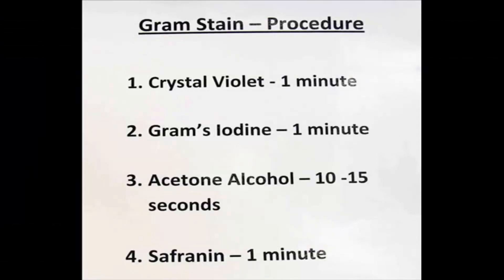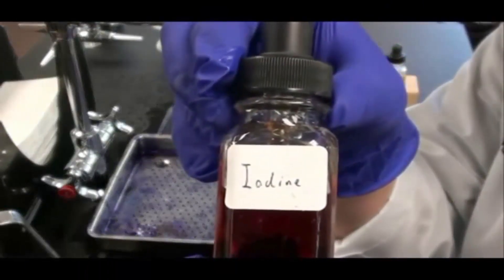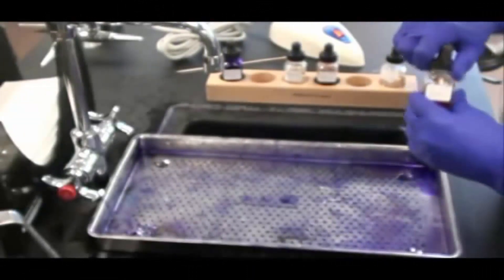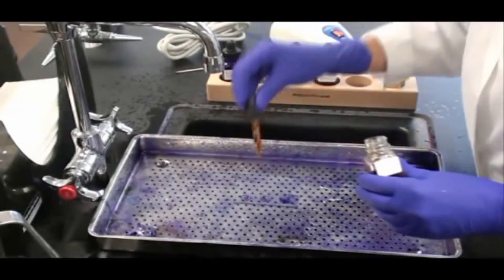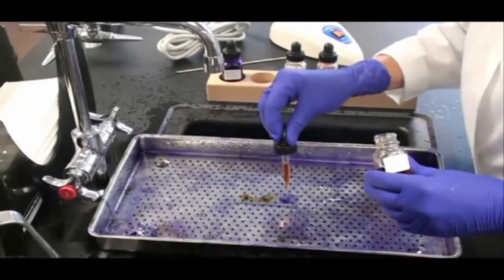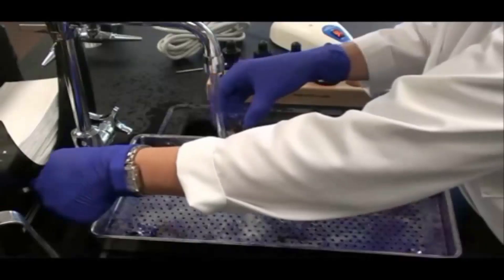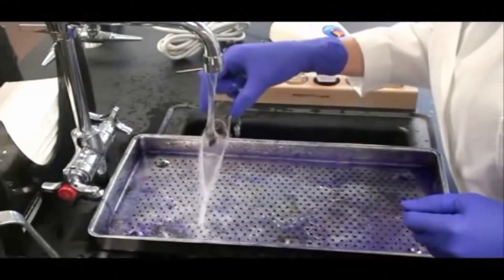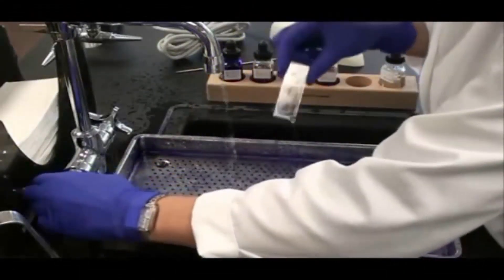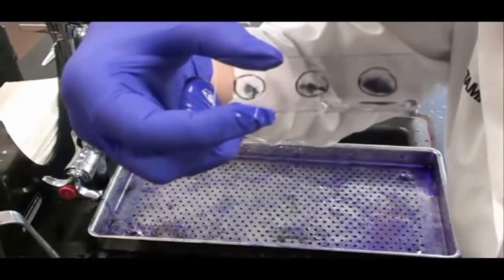My next step is to apply the mordant Gram's iodine. I will leave that on for one minute. What the mordant does is it binds with the crystal violet to make a big molecule. This big molecule gets trapped in the many layers of peptidoglycan in the Gram-positive cell wall. Gram-negative cell walls do have peptidoglycan but fewer layers and the big molecule does not get trapped. After waiting one minute I rinse the iodine off my slide. The three circles look a little darker, a little bit darker purple.